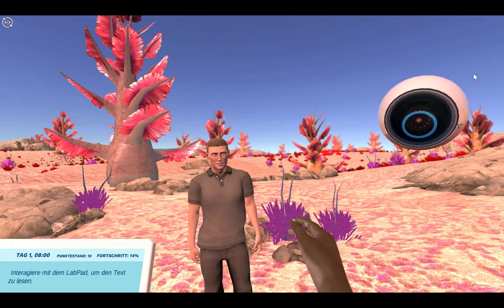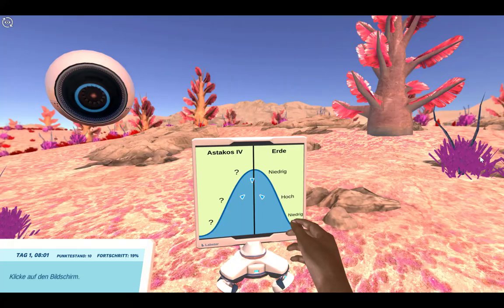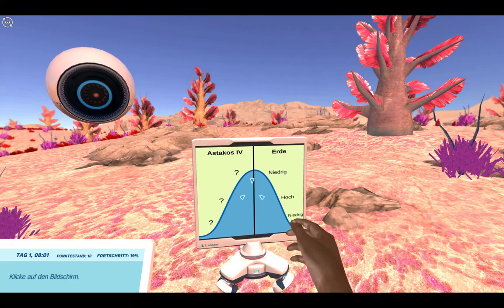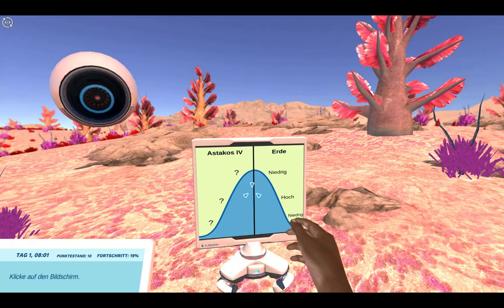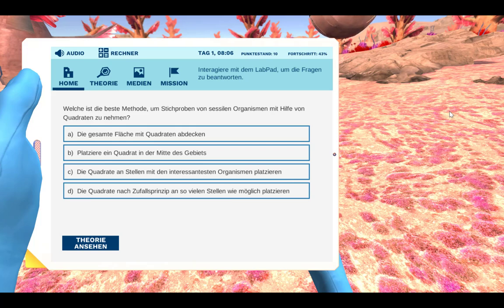If students don't know what to do next, they can ask Dr. One — as we call it — and it gives them some tips. Along the way in the simulation there are also quiz questions, to really see how the students are understanding the topics.